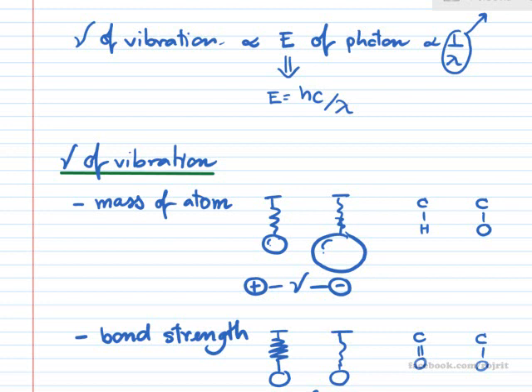If you have a very strong spring, and again you pull it down from the ceiling the same distance as with a weaker spring, the one that has the higher frequency of bouncing is the stronger one. So we can say that the triple bond has higher frequency than the double bond, and higher frequency than the single bond, respectively.